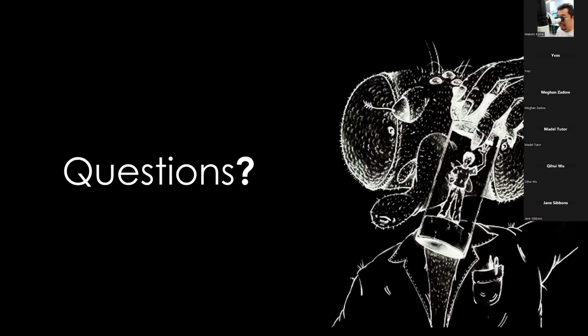Okay, so the lipid droplets don't expand, and they don't survive the protocol really well because of the denaturation steps and the others. In my case, for example, I have this 2 millimeter long sperm, right? And it has the axoneme, which is a microtubule structure, and a part of it breaks into small chunks because it's very rigid.